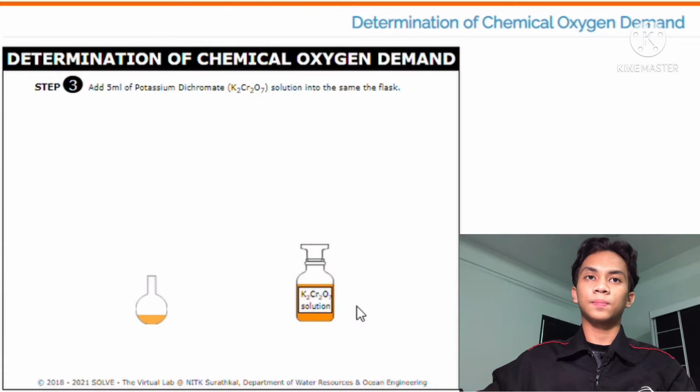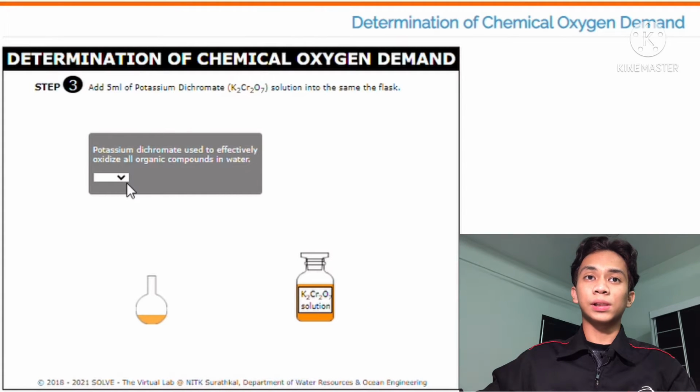Put on the cap. The question is, is potassium dichromate used to effectively oxidize all organic compounds in water? The answer is true.